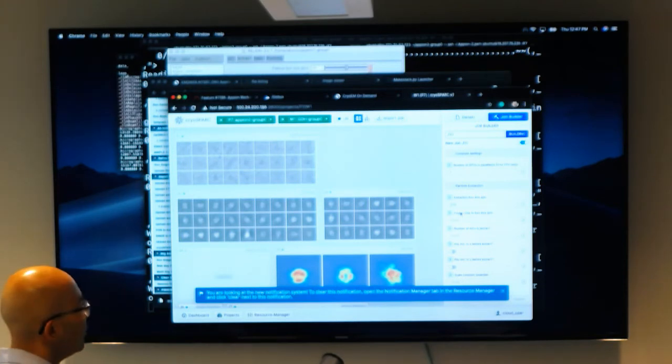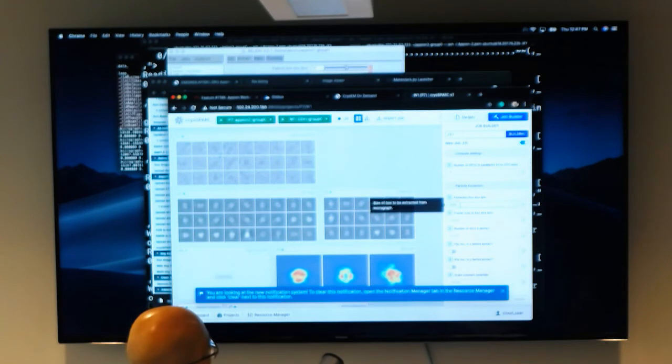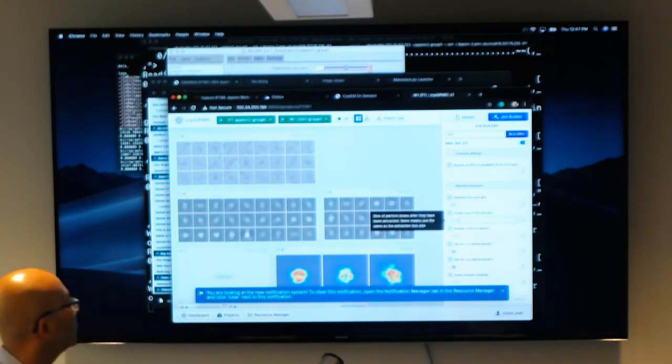This is the same idea whether you're in Relion or CryoSPARC: there's a job where you can specify your box size and whether or not you want to bin. But if you chose the wrong box size for some reason, you would have to go back and re-extract. So you essentially just go back to Relion and re-extract. Or if you had micrographs and particle picks in CryoSPARC, or you loaded them into CryoSPARC, then you could re-extract here as well.